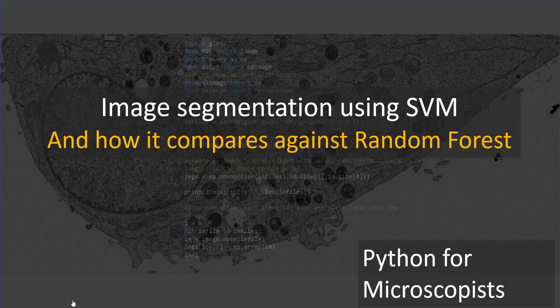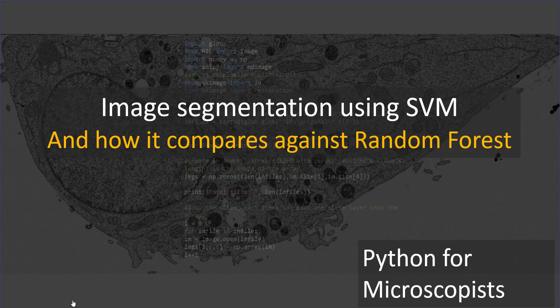Hey guys, you're watching Python tutorial videos on my YouTube channel, Python for Microscopists. In today's tutorial, let's look at performing image segmentation using support vector machines, or SVM for short.